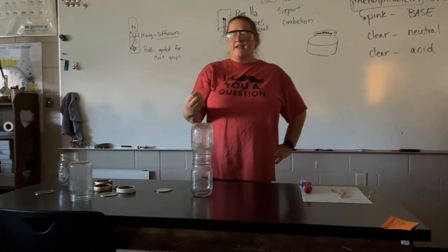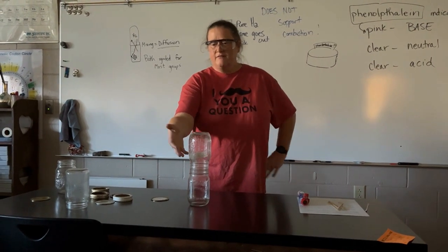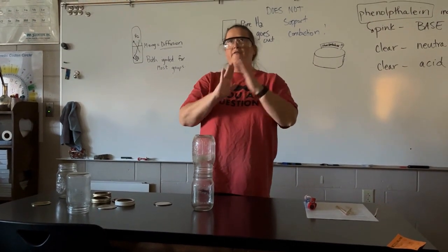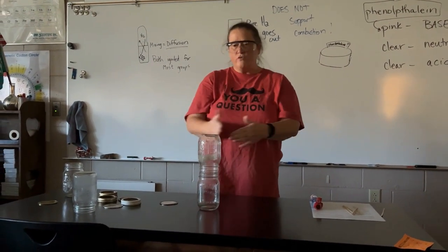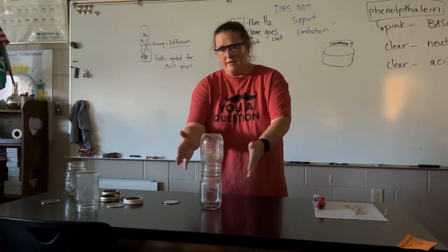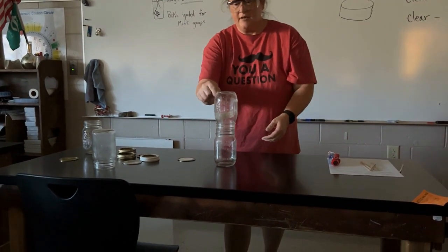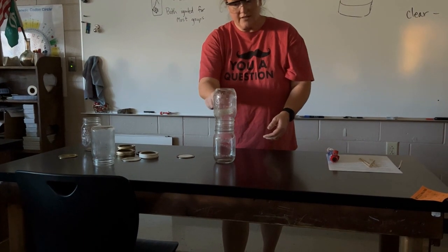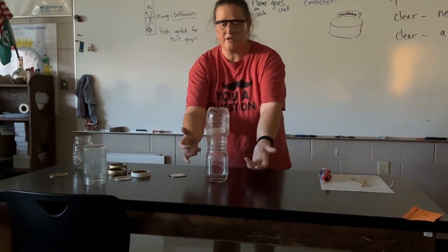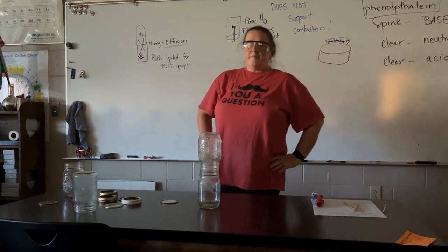Diffusion is when you take a gas or a liquid in high concentration, hydrogen here, and it eventually moves into areas of less concentration. Theoretically, this has been sitting here for about 10 minutes now. The hydrogen, even though it's less dense than air, should have made some of its movement down into the oxygen, and the oxygen should have made some of its way up into the top jar, which is hydrogen.